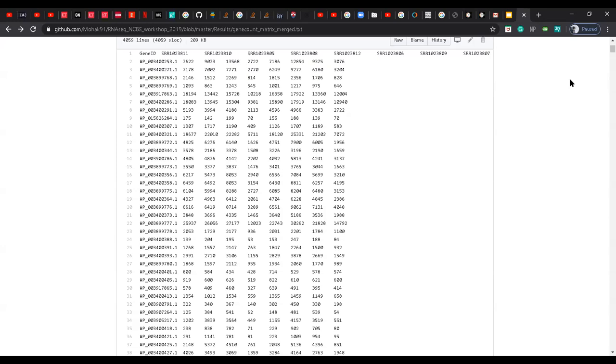So we did something called flagstat, which tells you how many reads you had. For example, if you had 1,000 reads, out of these 1,000 reads, with all the filters that you had given, how many reads actually mapped to the genome. So let's say from 1,000 you got 900 mapped, and the rest of the 100 reads did not map to the reference genome.